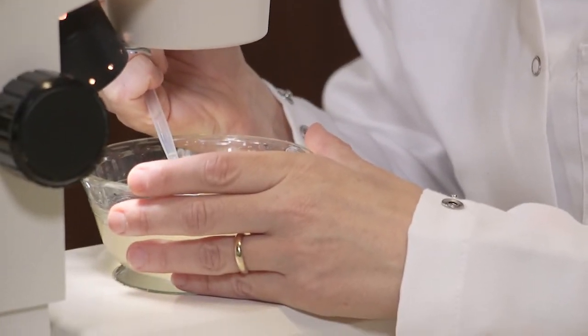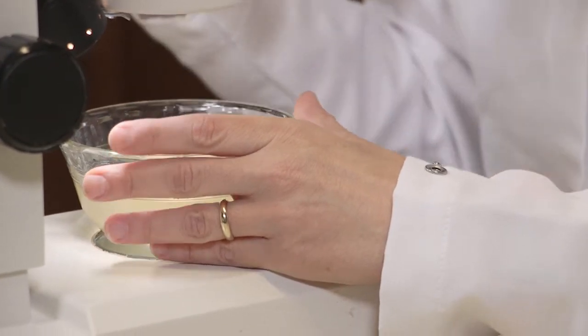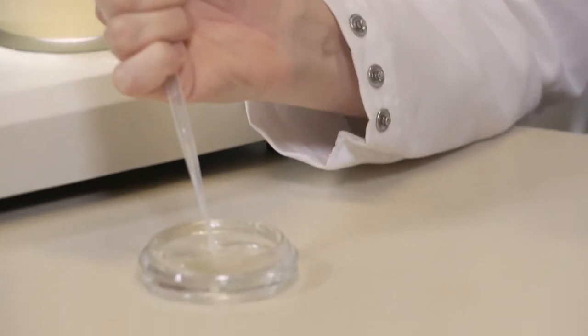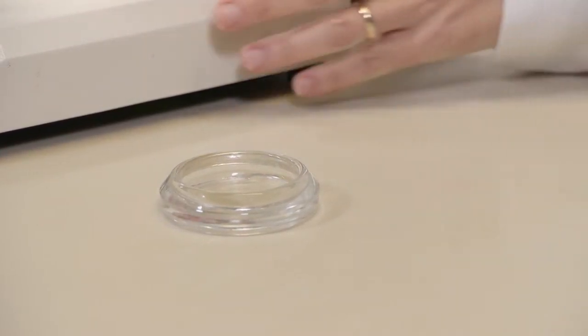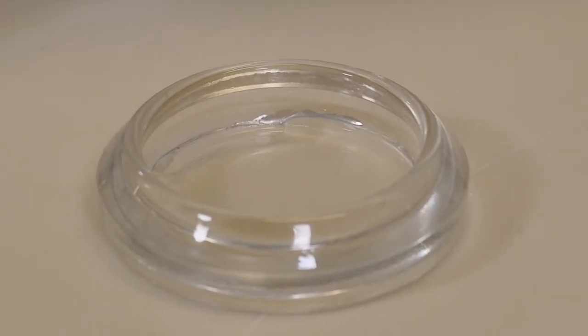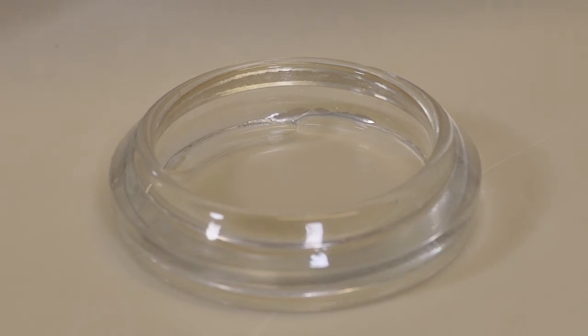Once you see a medusa, isolate it from the rest of the plankton using a pipette and put it in a petri dish with clean sea water. You can now try to identify it using the appropriate bibliographic sources.